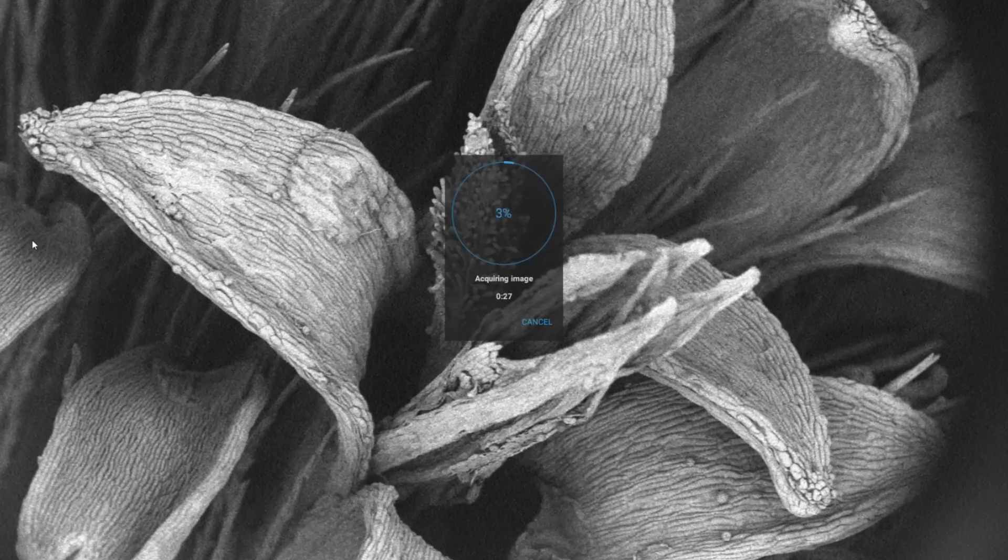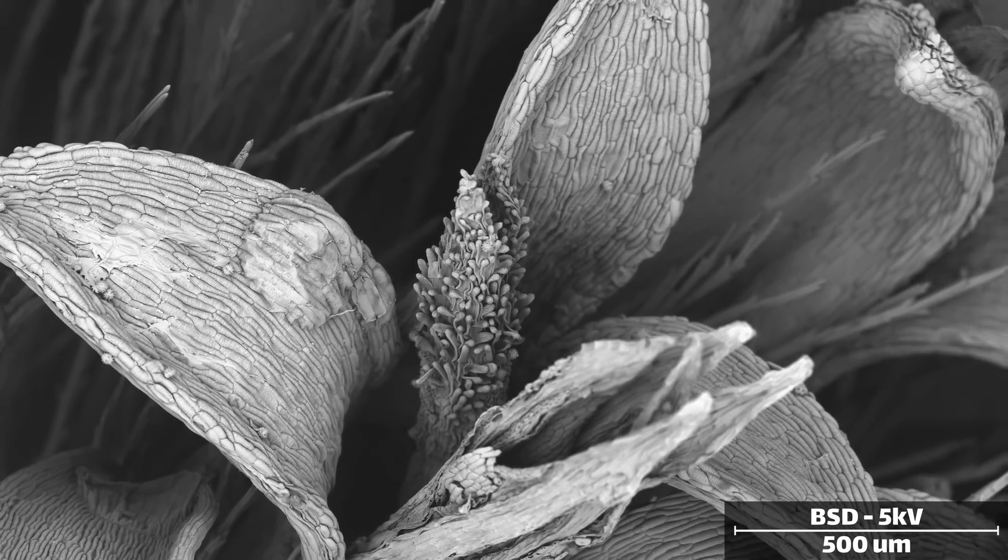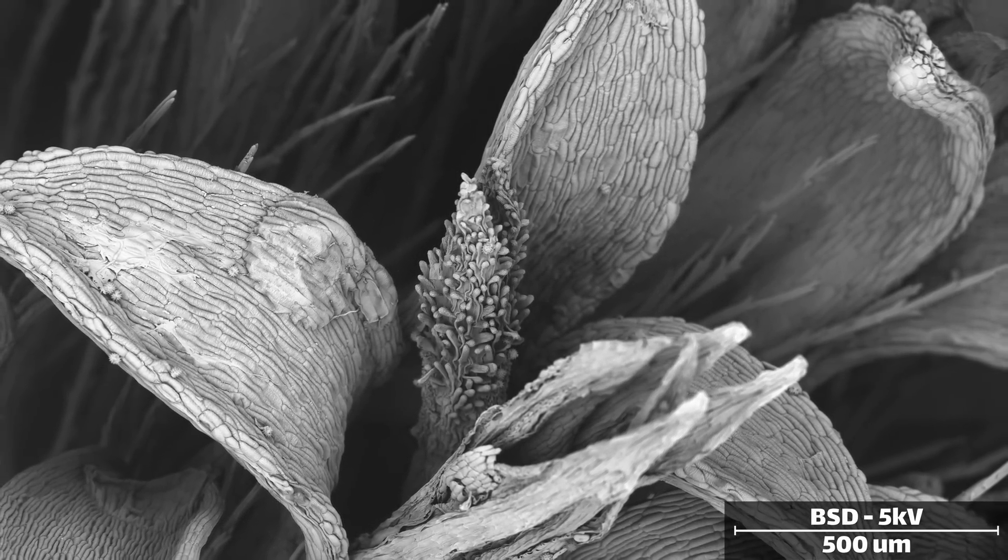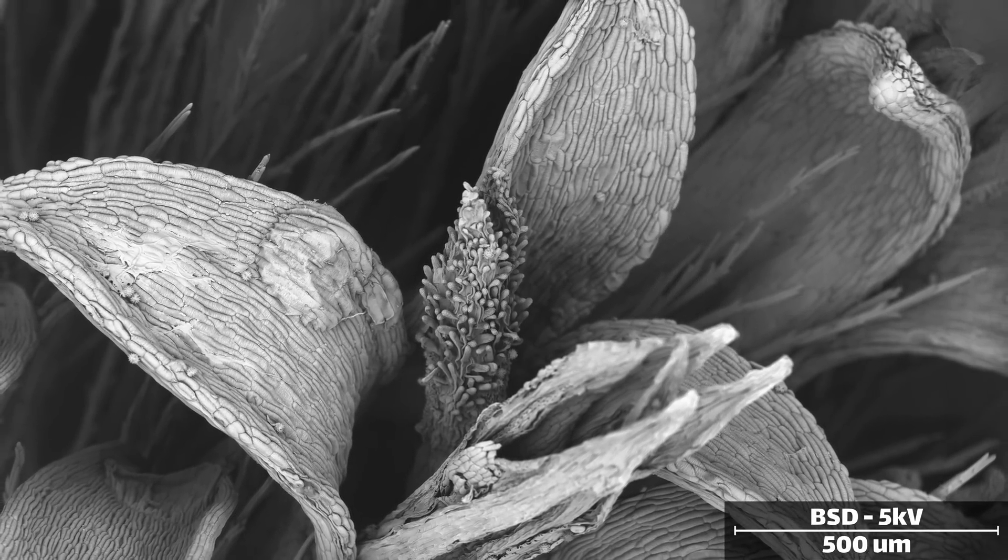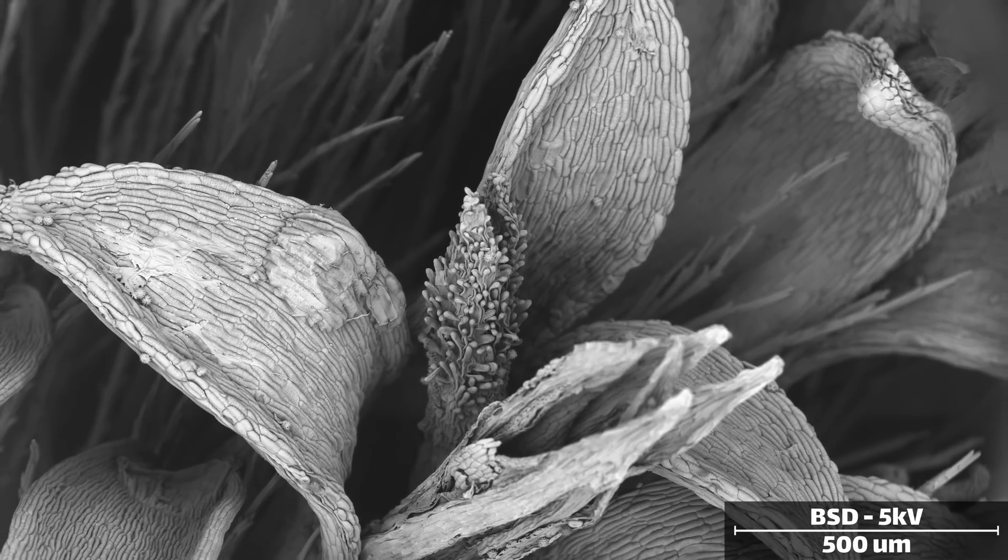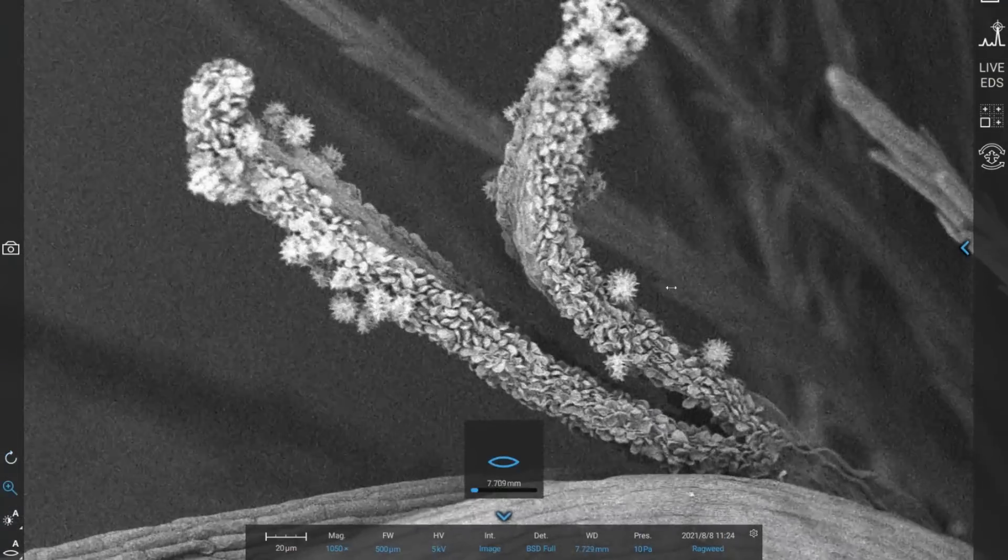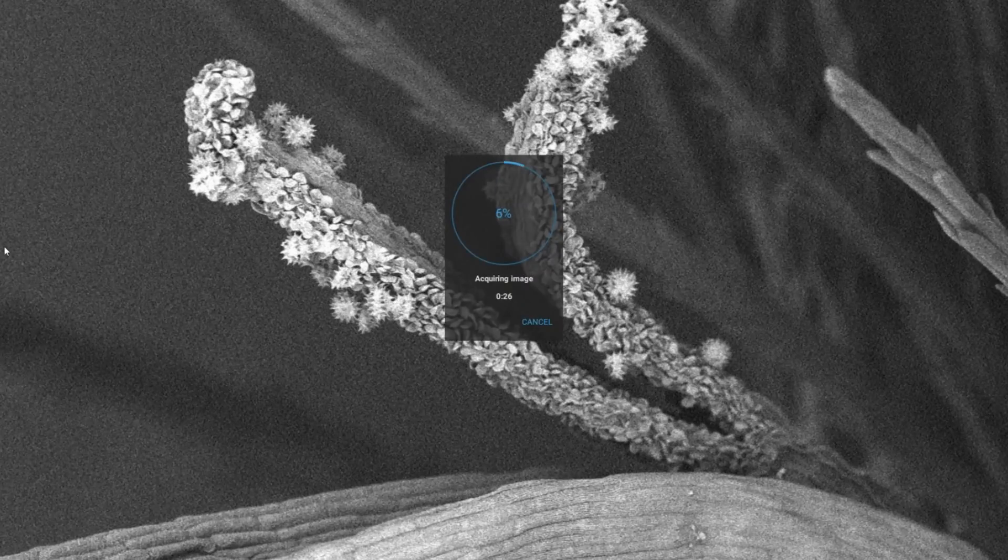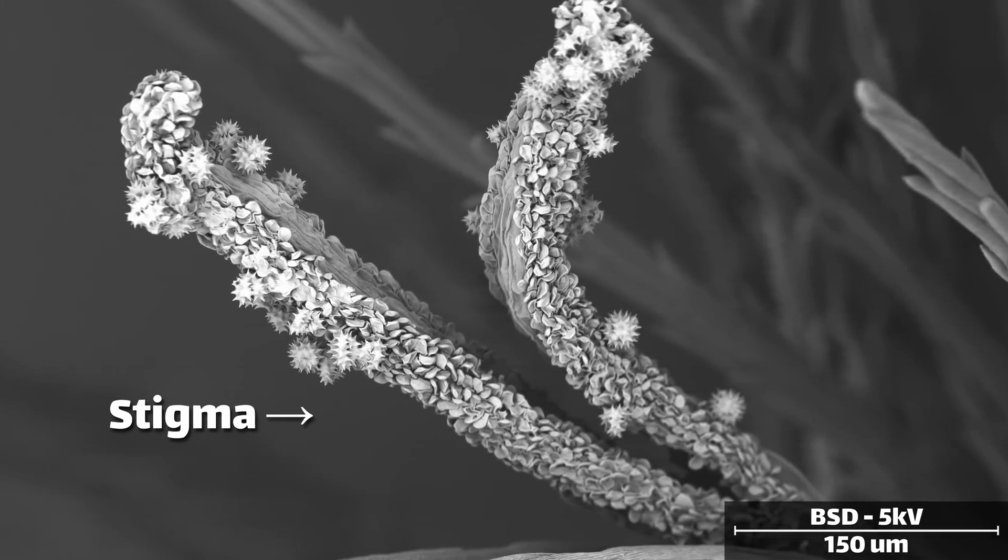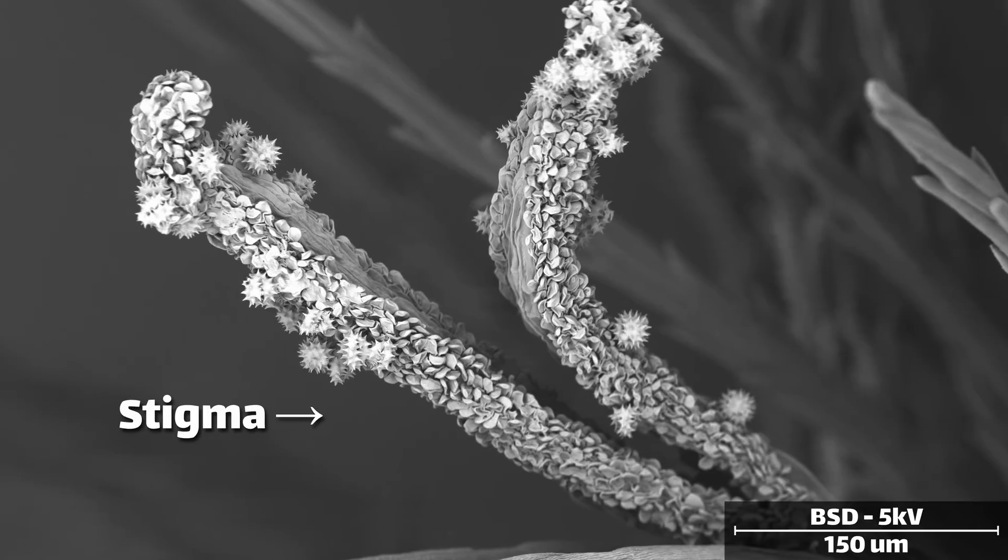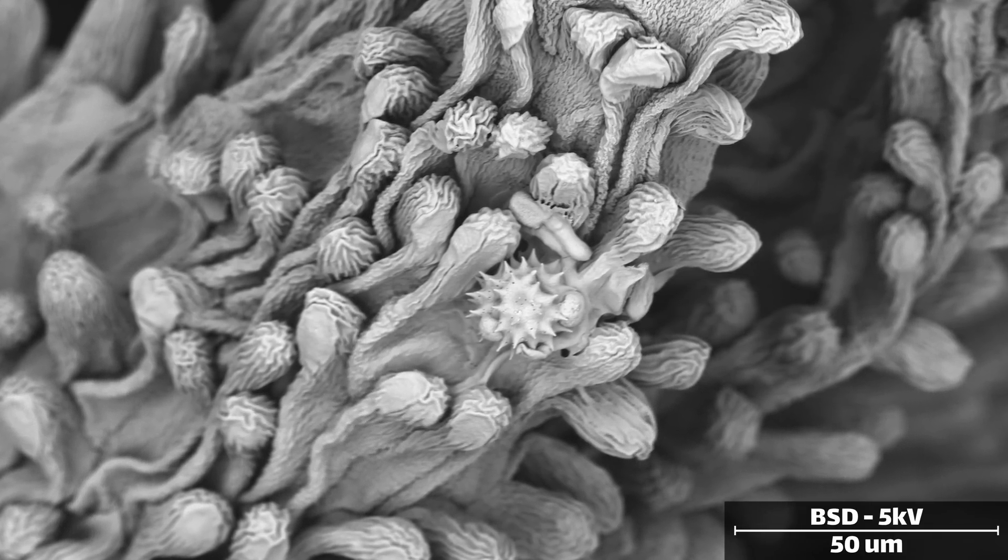There are some interesting landmarks to point out in the scanning electron micrographs. First are the visually striking stigmas. These are the female portions of the flower, which are responsible for transporting sperm to the ovary. When a pollen grain lands on a stigma, it will grow a pollen tube and attach to the stigma. The sperm cells inside of the pollen grain will migrate down the tube, through the stigma and the style, eventually fertilizing the ovary at the base of the flower. On a goldenrod, these take the form of a forked structure that have small finger-like cuticles. You can see pollen clinging to most of the stigma in these samples.